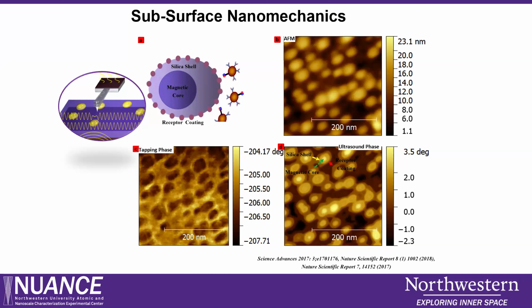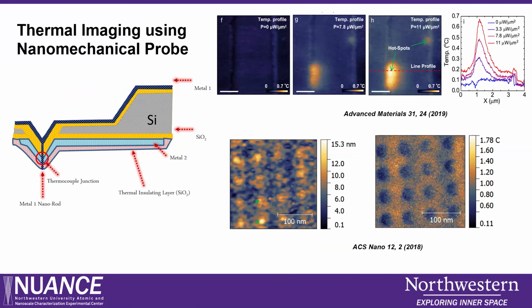We are working with Toyota Motor Corporation to identify the defects in battery electrodes and all those things. I'm just presenting here one of the examples in life science, but mostly you can do physical and other techniques. This is also one of the things here, the scanning thermal microscope.